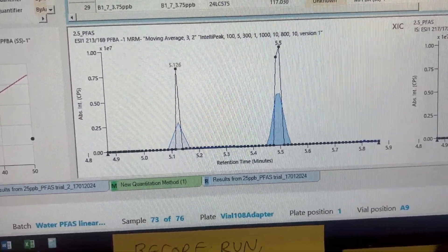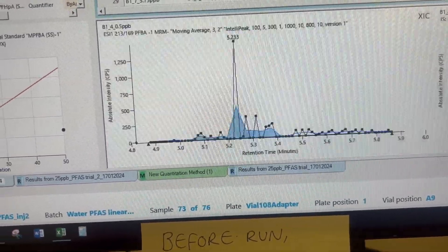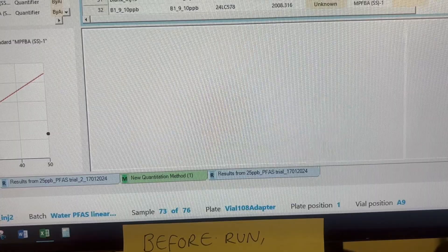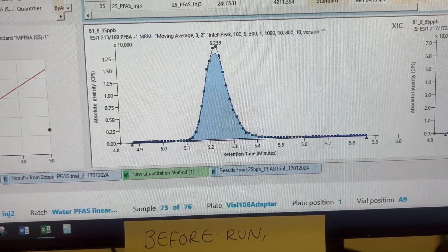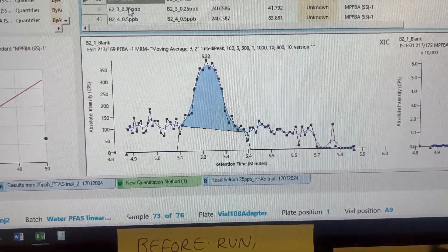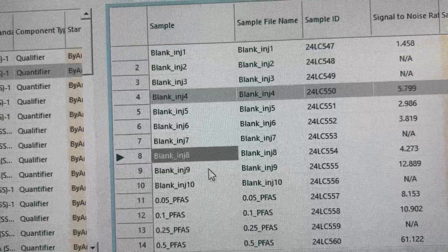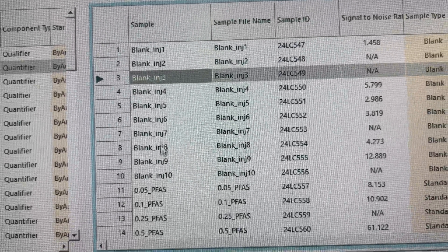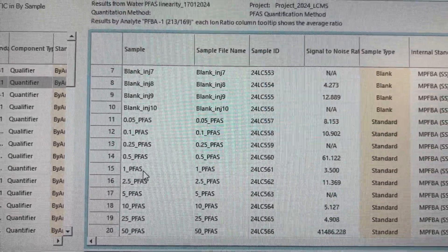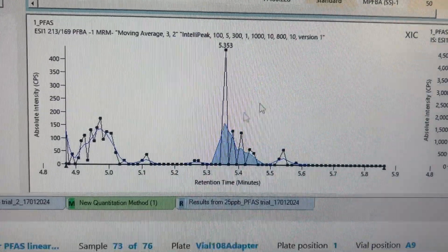I've seen this happen before. It's a question of whether it has stabilised into the samples, which I don't think it did. So I think I'm just going to rerun all of the samples again. Look at that — no peaks. Where are my peaks? Then it started to stabilise. It's so annoying because I literally run 10 blanks — 10 solvent injections — at the beginning of the run to try and stabilise everything and get a good equilibration. It's cleaned everything up the column, but this has still happened. So I'm just going to rerun it over the weekend and analyse the data on Monday.